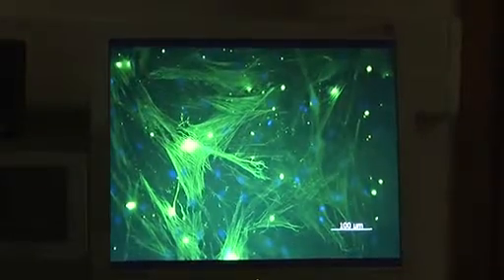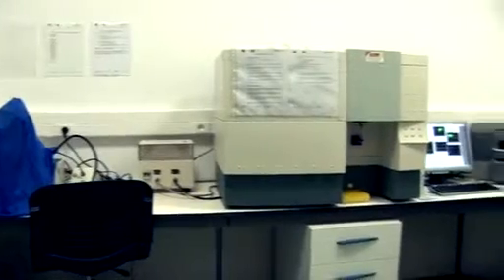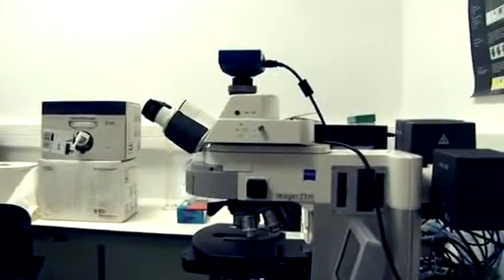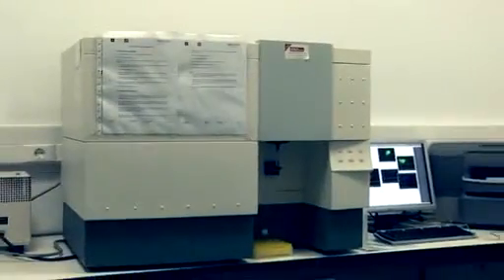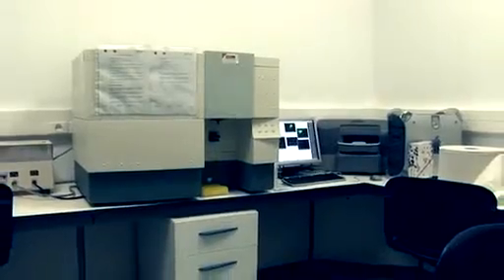The reproducible microscopic examination of the biological performance of the developed biomaterials, as well as of the diverse primary and stem cell populations isolated from several sources, can be accomplished with bright field, using either transmitted or reflected light, and fluorescence after appropriate cell staining. A full and complementary characterization of cell subpopulations of interest can be carried out by multiparametric flow cytometry analysis.